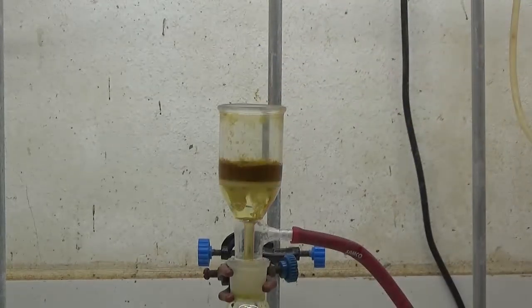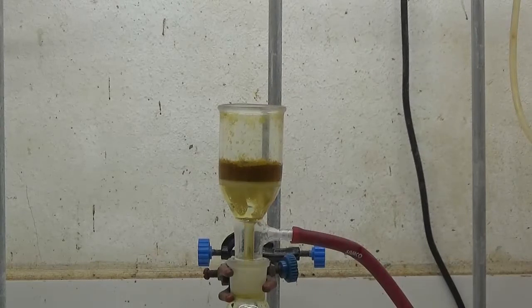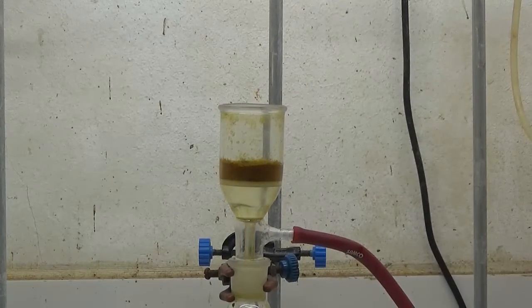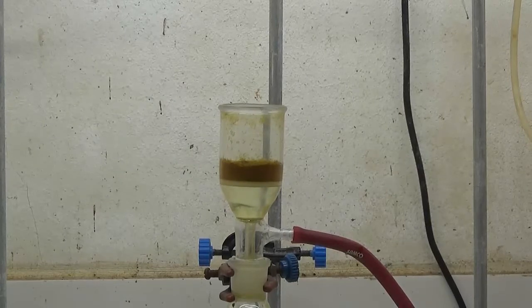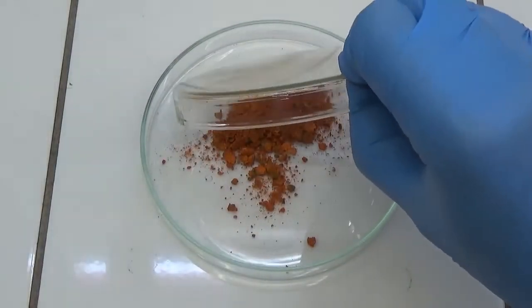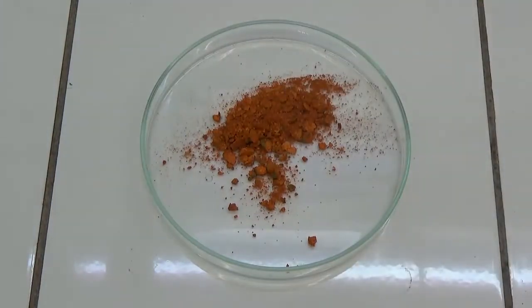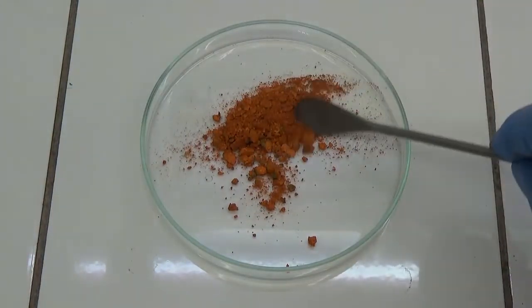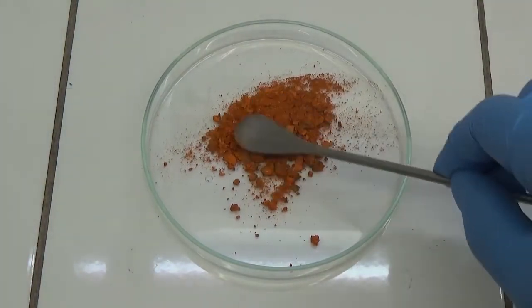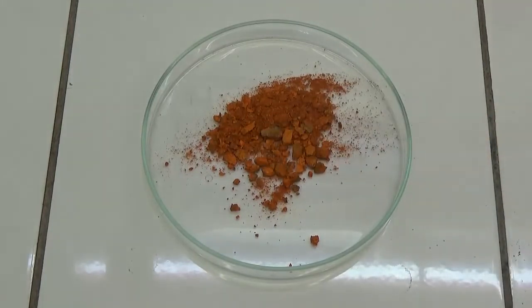Dry the product by passing air into the filter funnel and then with heat in oven at 60 degrees Celsius. The product obtained is an orange powder that melts above 300 degrees Celsius. It can be crystallized from water to purify.